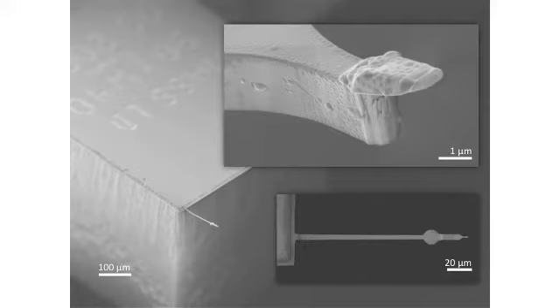And in the end, what we have is our original cantilever, and now we've got this piece of gallium arsenide. It's mostly gallium arsenide here, and then there's an indium gallium arsenide quantum well in this case for this particular sample, but it could be any other heterostructure. It could be a layer of quantum dots. The main idea is here we wanted to see that we could do this and still have a nice lever. And the lever, if you treat it the right way, will still have a nice quality factor and still work well as a force detector.